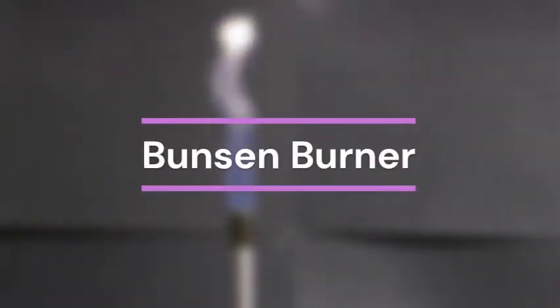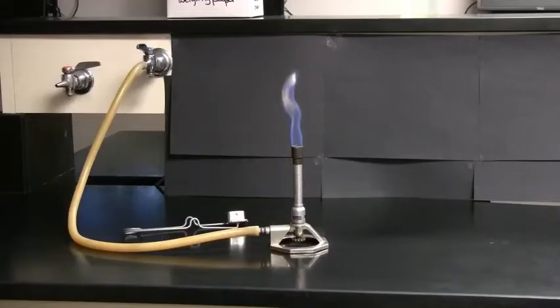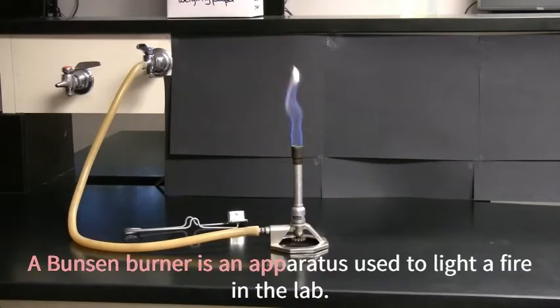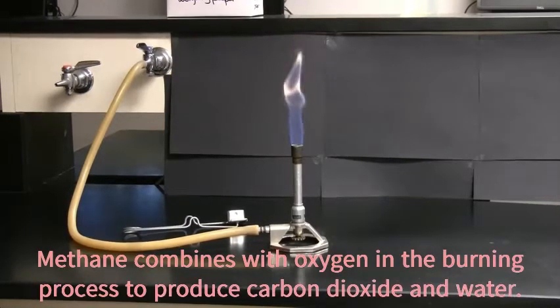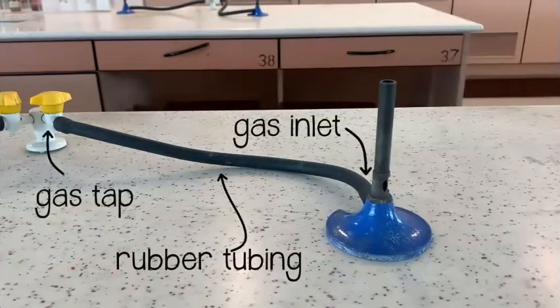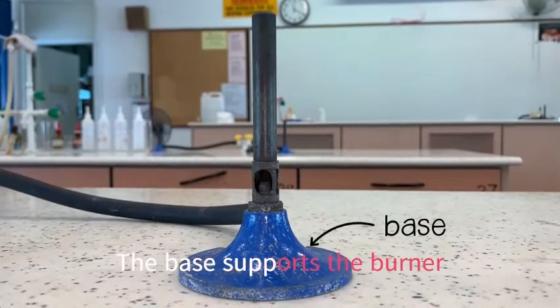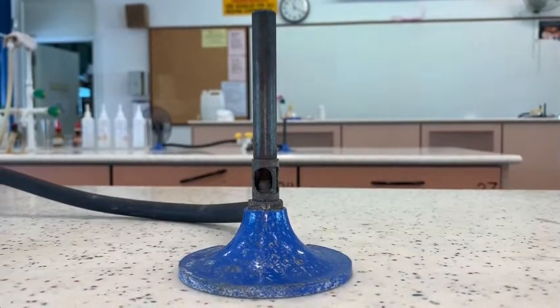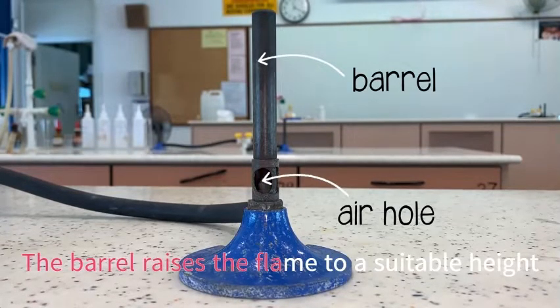The Bunsen Burner. A Bunsen burner is an apparatus used to light a fire in the lab. Methane combines with oxygen in the burning process to produce carbon dioxide and water. The parts of a Bunsen burner include rubber tubing, gas inlet, gas tap, base. The base supports the burner. Air hole, barrel. The barrel raises the flame to a suitable height.